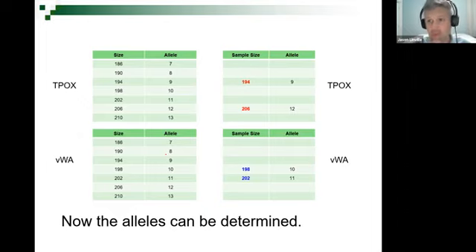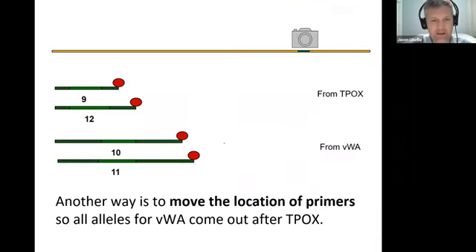All right. So ideally, if we want to amplify 3 loci, we use 3 different dyes. If we want to amplify 6 loci, we use 6 different dyes. If we want to amplify 16 loci at one time, we use 16 different dyes. The problem is we can't use 16 different dyes. Because in order for this red dye to be differentiated from the blue dye, the camera needs to be able to differentiate them. And the camera can't differentiate a red dye from a red-orange dye, from an orangey-ish, redder-ish dye. Remember, they're all coming out of the same colors. They really need to be separate colors, and you can only squeeze so many colors next to one another.